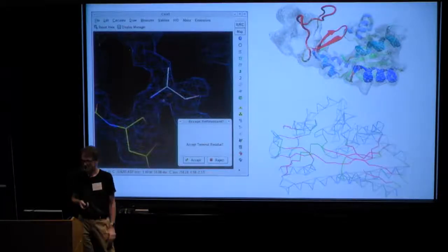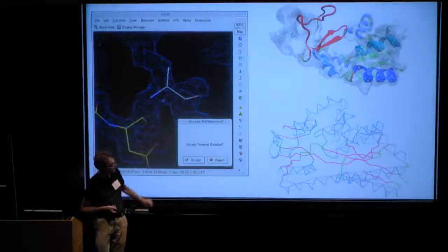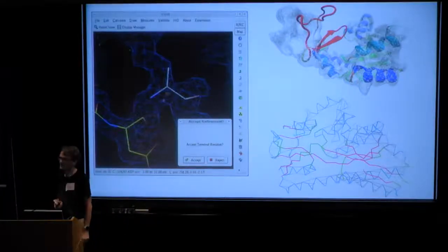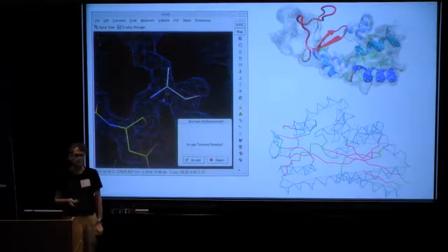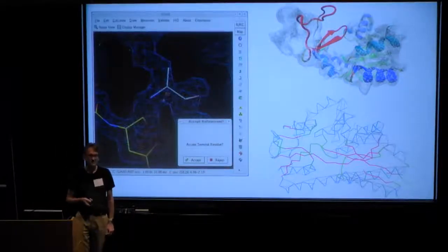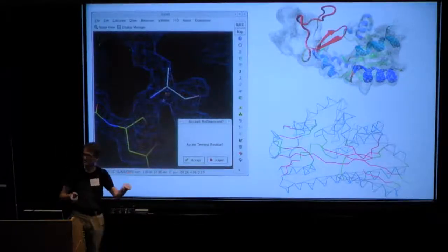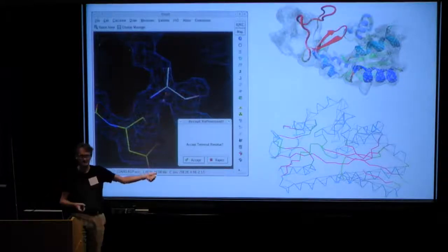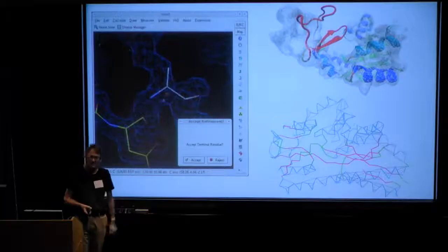And then you can try to rectify that by having a scaffold, so you apply lots of distance restraints inside of all your secondary structure elements. Now, that is fine if none of your secondary structure elements actually changed. But if you have some of these secondary structure elements that should bend, right, you started by assuming that there are scaffolds and they can't bend, and then I'm not going to be able to bend them.